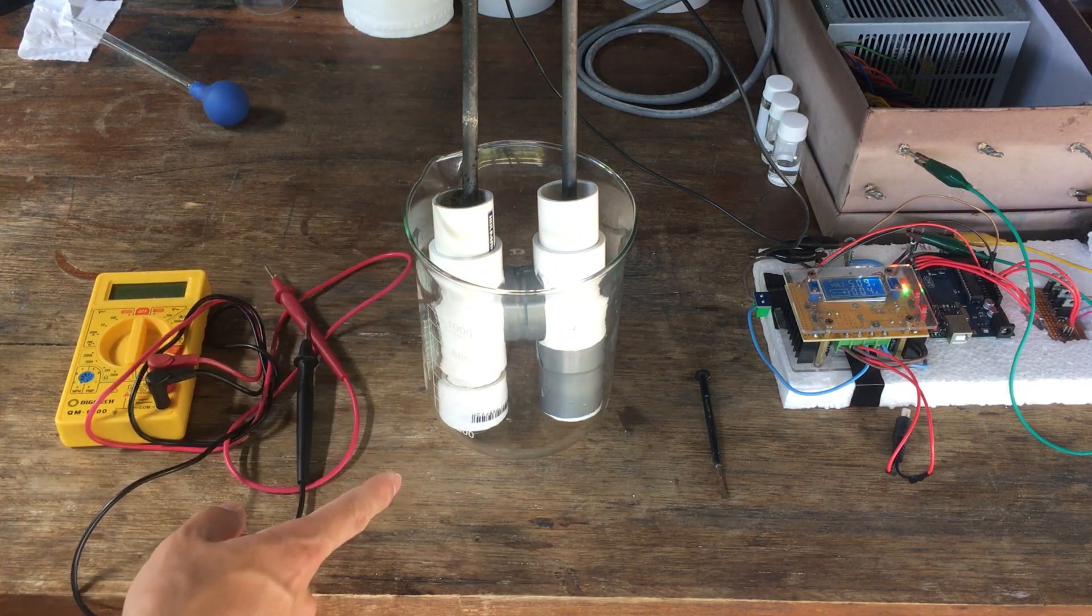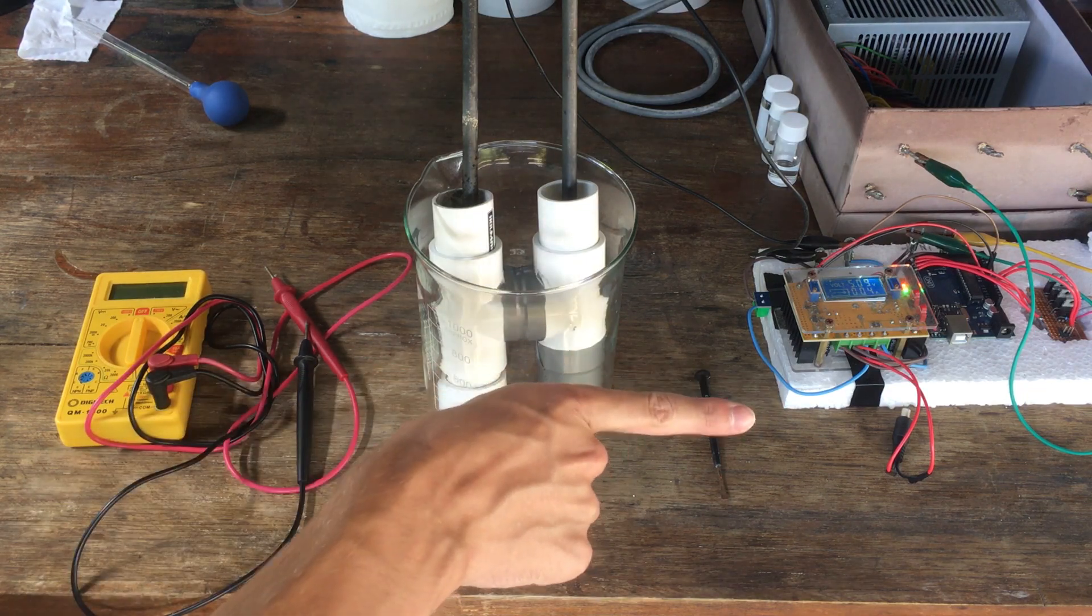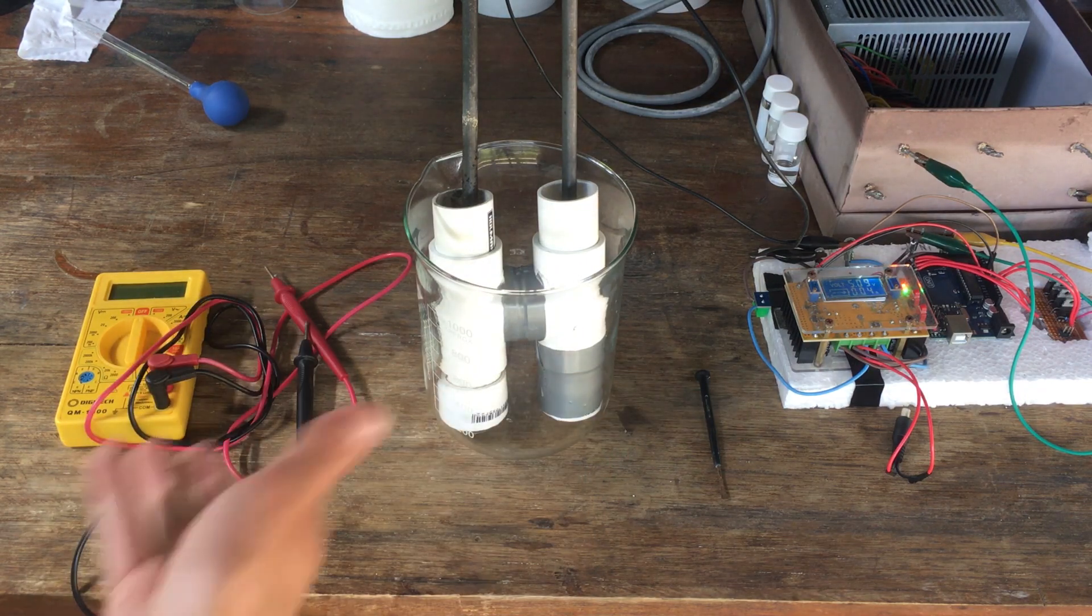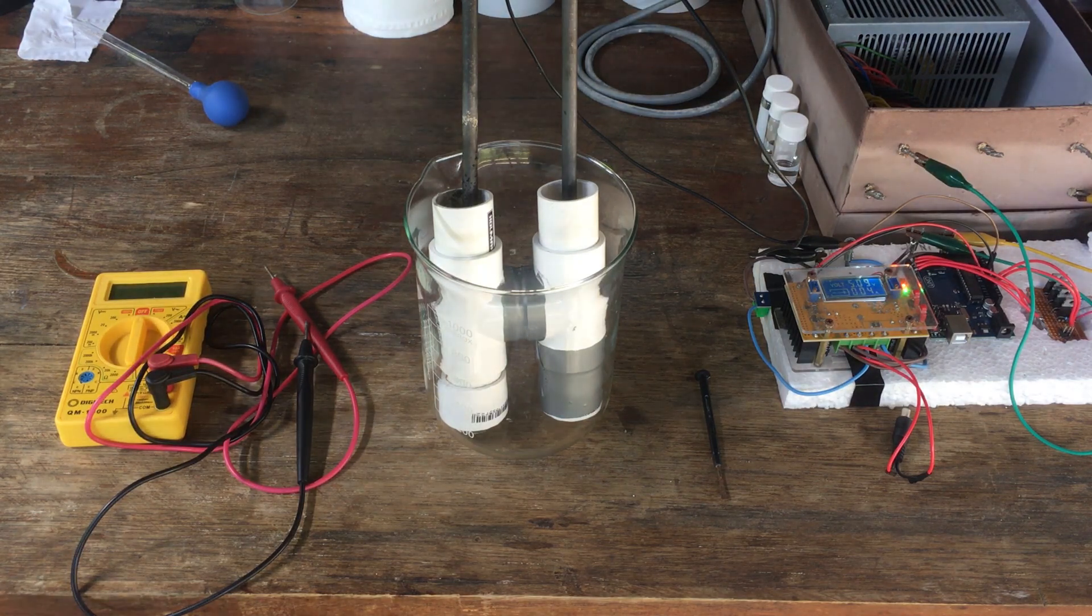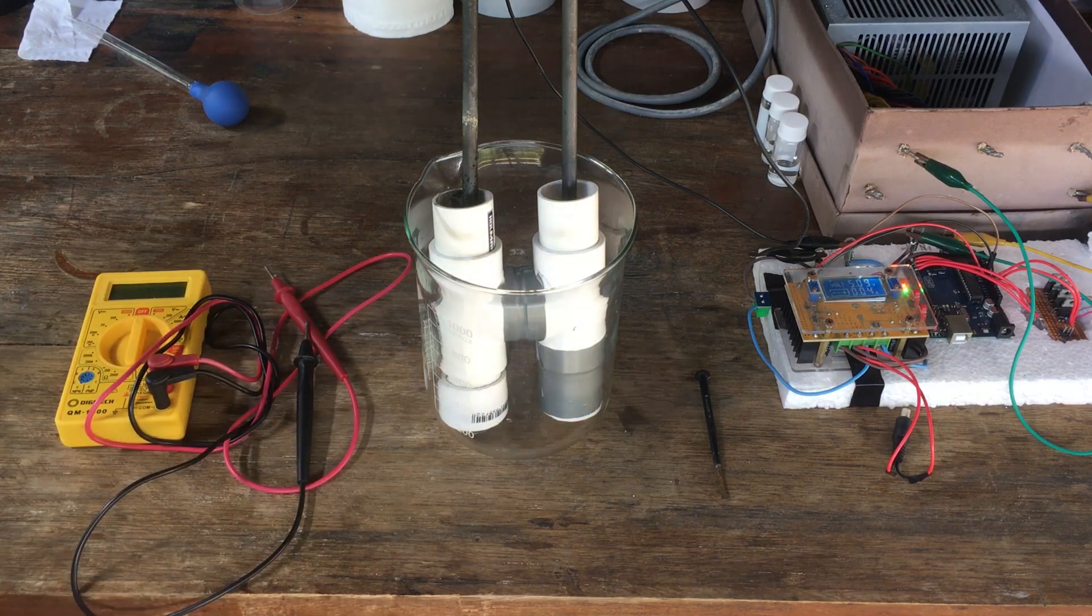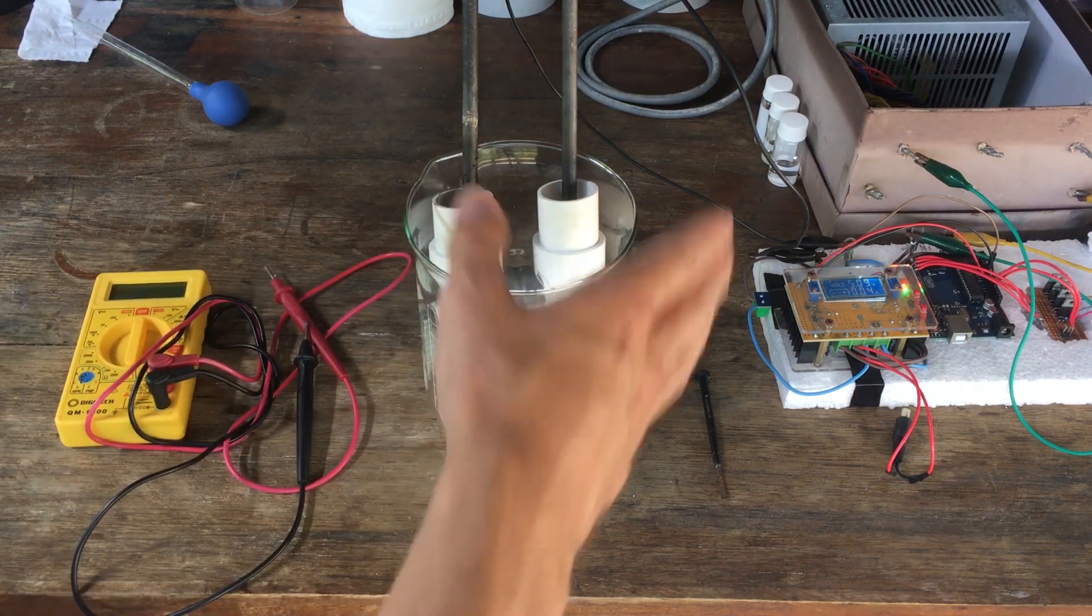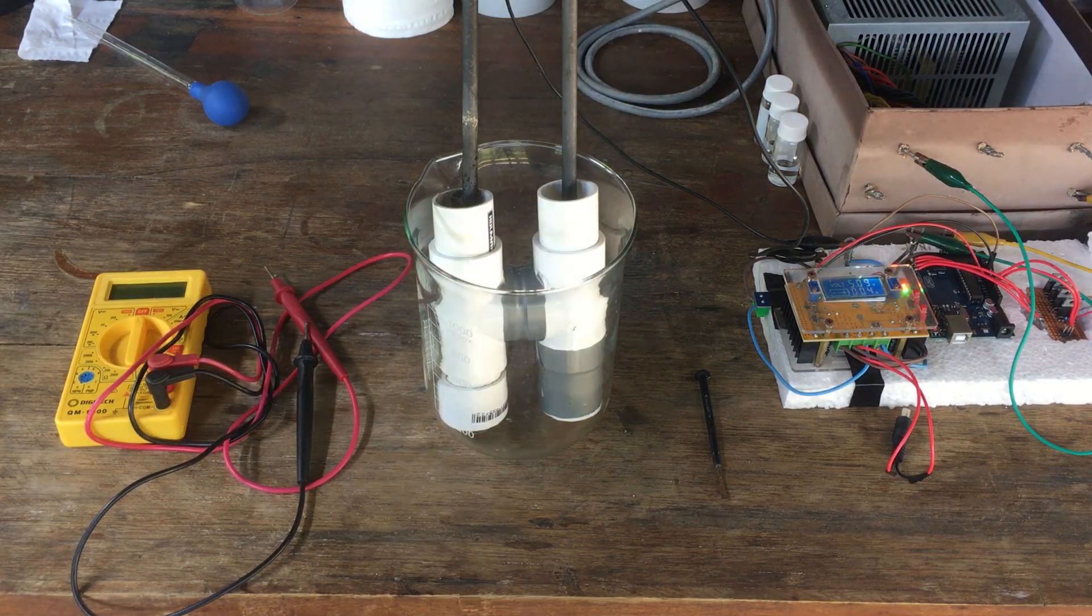What that means is, as we run the cell and generate a little bit of alkali hydroxide in the cathode chamber on the right, the current that we put through the cell, and we're talking about any cell here, whether it be sodium or potassium, has two ways in order to get that charge transfer going. First of all, we can have the alkali ions, so the sodium or the potassium ions, flow that way towards the cathode through the cell. That's one of the forms of charge transfer that we can get between the two half cells. Or hydroxide ions from the cathode chamber can flow towards the anode, and that will achieve the same effect of charge transfer allowing for completing the circuit and current flowing.